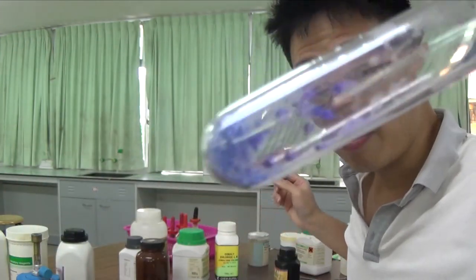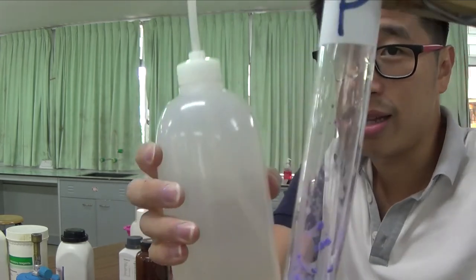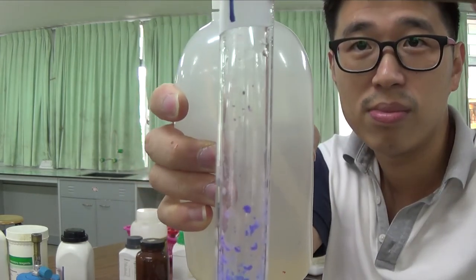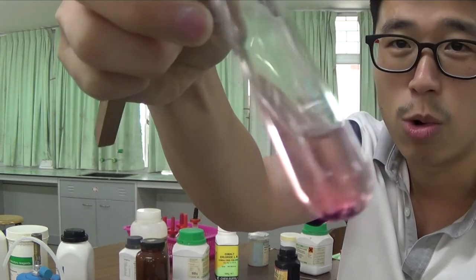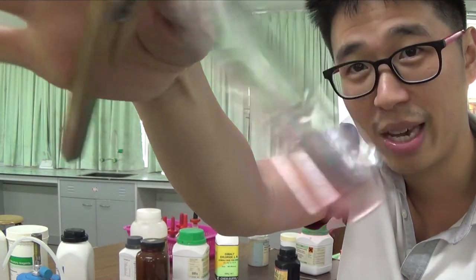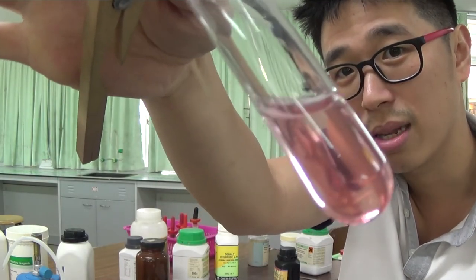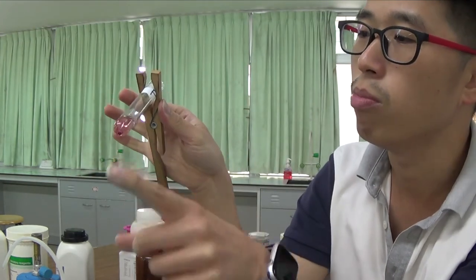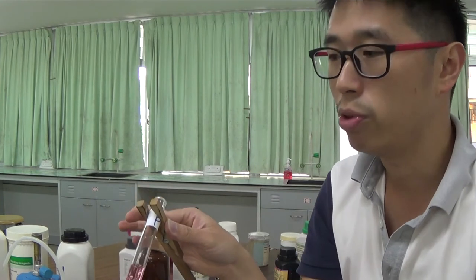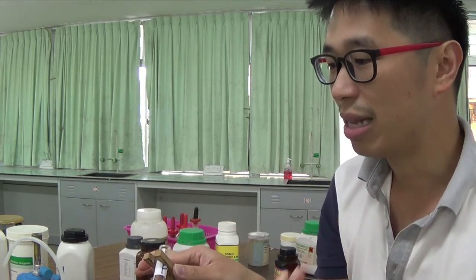So this was purplish. I'm just going to add distilled water to it. What color do you see? In the presence of water, the blue color will go pink. What I could do then is heat it and remove all the water, and it will go back to blue. So this is the beginning of the idea of reversible reactions.